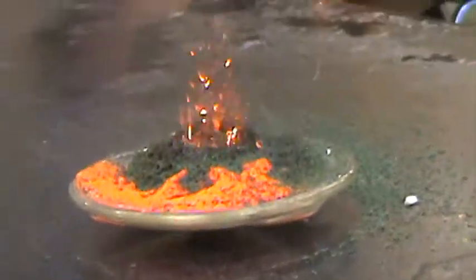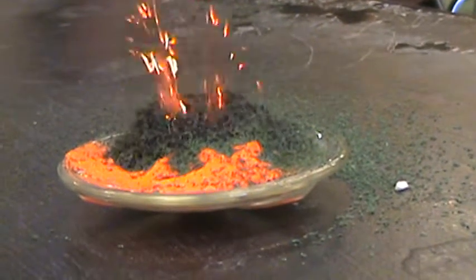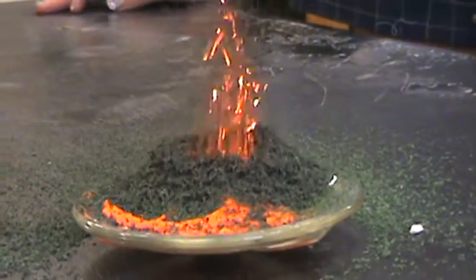What is going on? This is crazy! Dude. It's turning it green. It's a volcano. That is nasty. Oh my god.